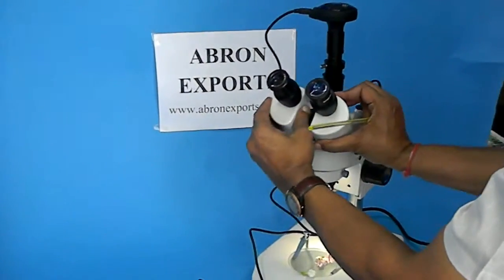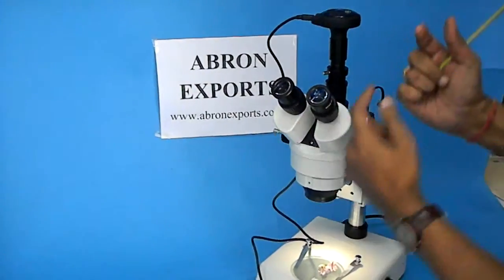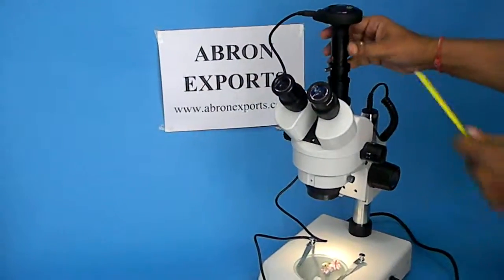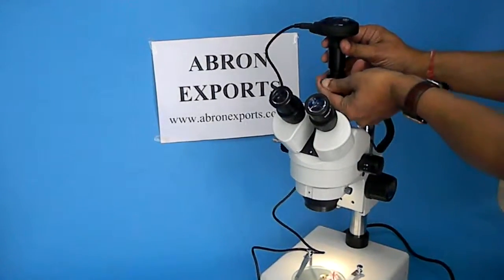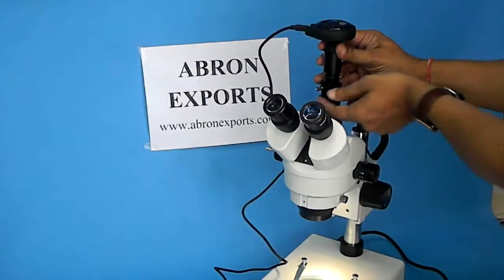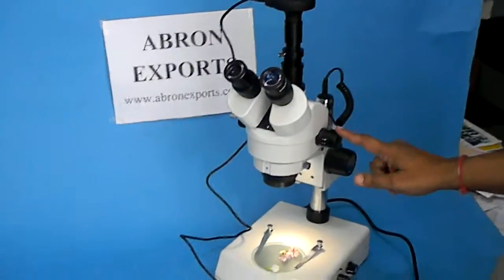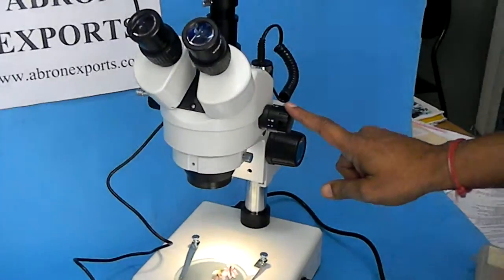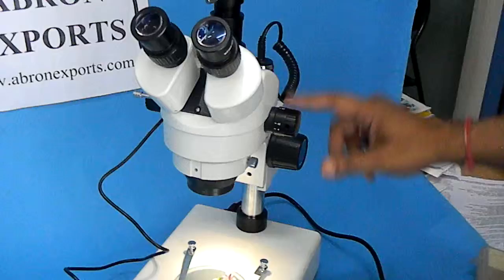This is for interpupillary distance. You can adjust as per your eye. This is for adjusting the camera, putting the camera on the third eye. And this is a zoom for selection of the microscope.